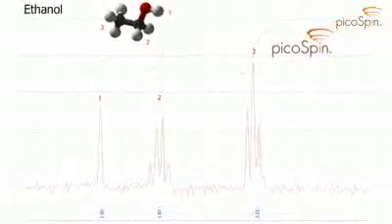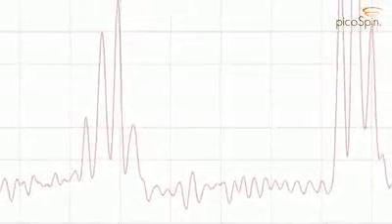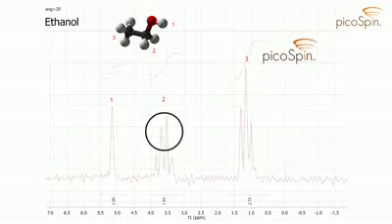Let's take a look at this simple spectrum of ethanol. This shows how the PicoSpin45 can be used to demonstrate the three basic features of proton NMR. First, the chemical shifts of the three different kinds of hydrogen atoms in ethanol are well resolved, with the more screened protons appearing at higher fields. Here, the CH2 and CH3 splittings are also clearly resolved, demonstrating the N+1 rule for multiplets.